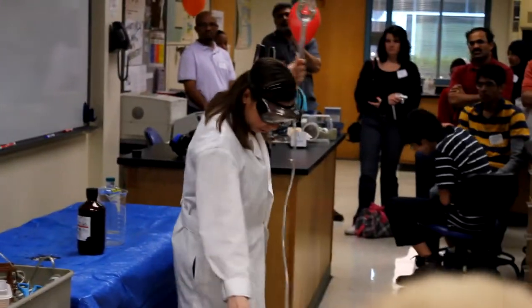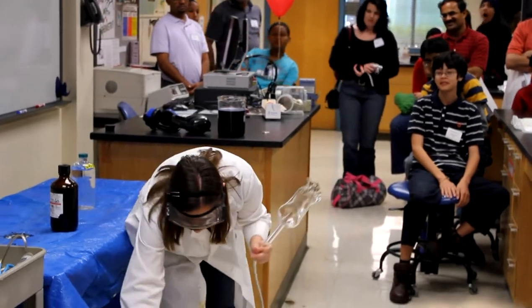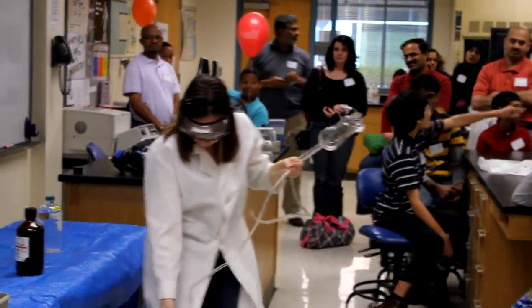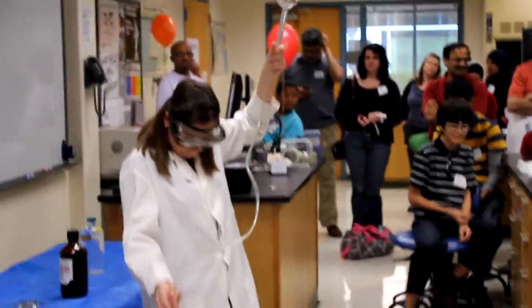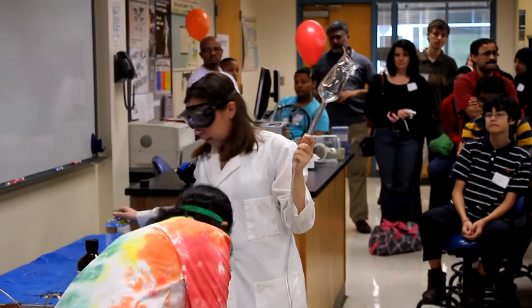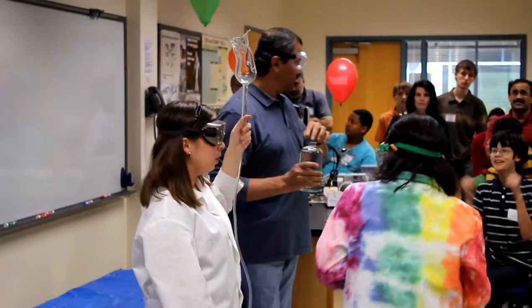So what we have here is what we call the Statue of Liberty. For this Statue of Liberty, I need my helpers, which have disappeared on me. What I need my helpers to do is take these two solutions and pour them into my torch. If somebody could turn off the lights — we're going to make the torch glow. We'll put it together at the same time.